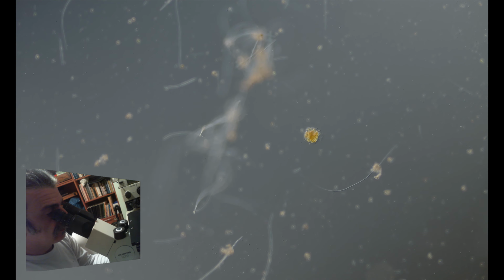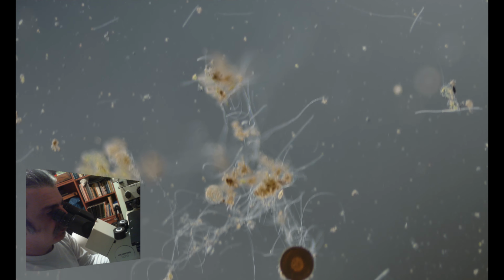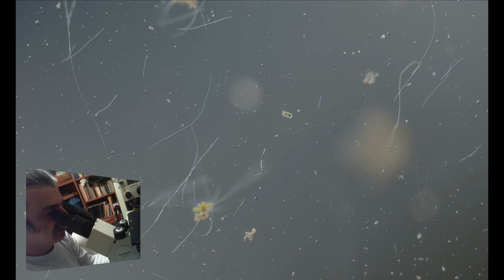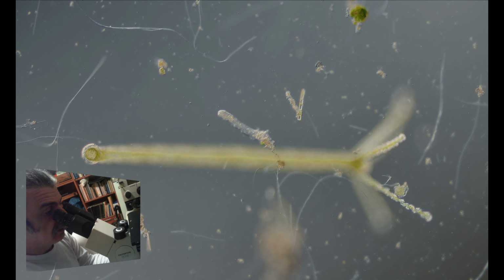Okay, let's get back to, let's say, 10x and see which other nice creatures we can explore. The biggest magnification is not always the best one, and for scanning and finding things it's much better to first use a smaller magnification and then go higher.